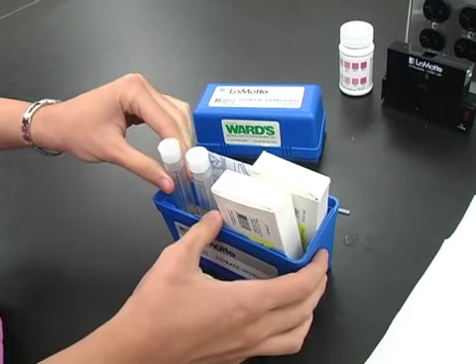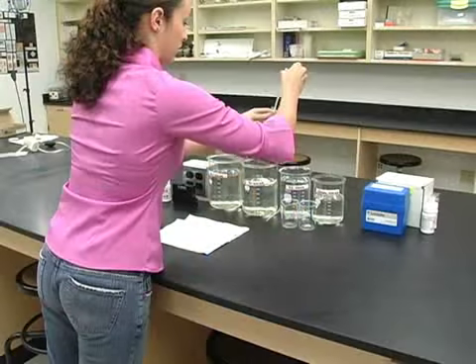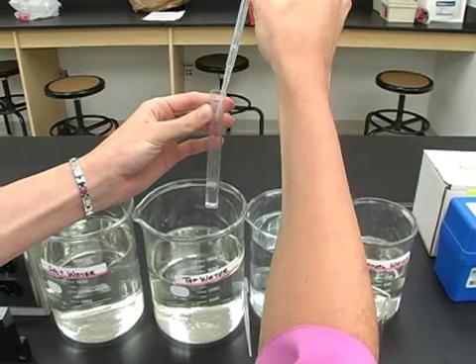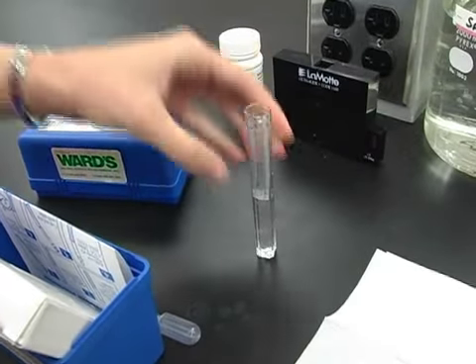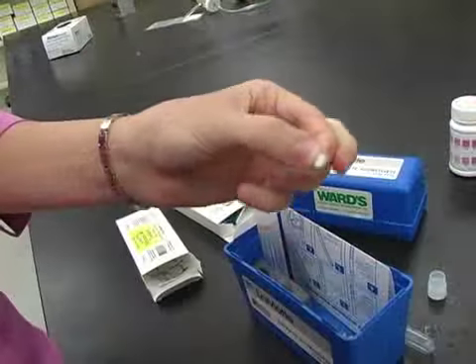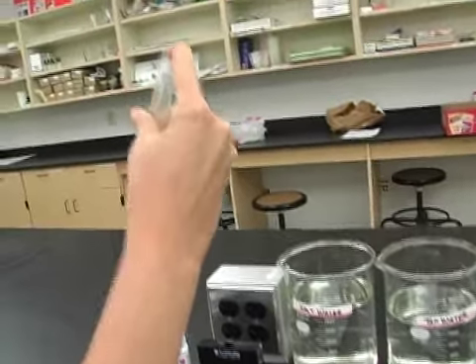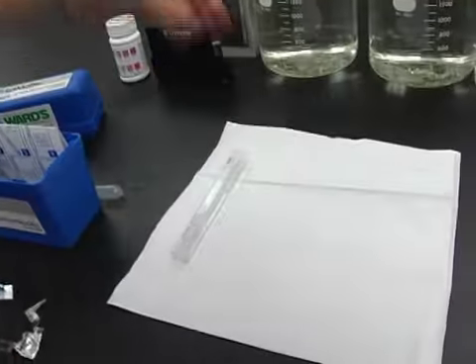There are two ways to test for nitrogen. The first is by a test kit. Fill a test tube to the 5 milliliter line with the water sample. Then add a nitrogen number 1 tablet. Cap the tube and mix until the tablet is entirely dissolved. Then add 1 nitrogen number 2 tablet. Cap and mix again until the tablet is dissolved. Then set the tube aside for 5 minutes.